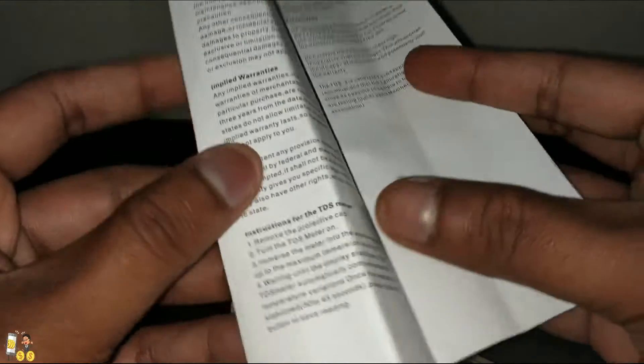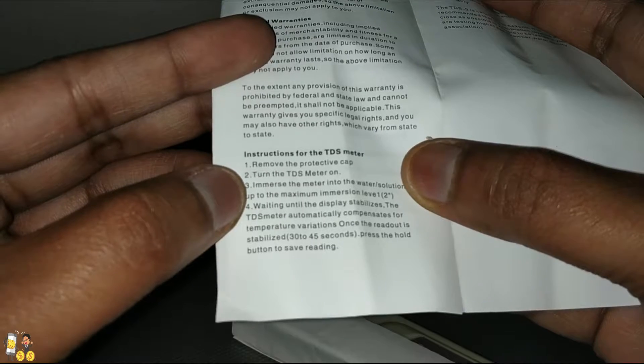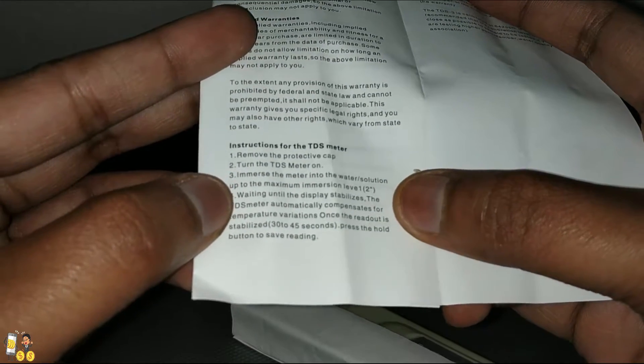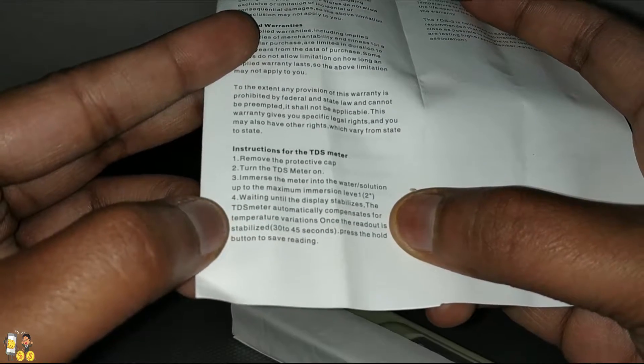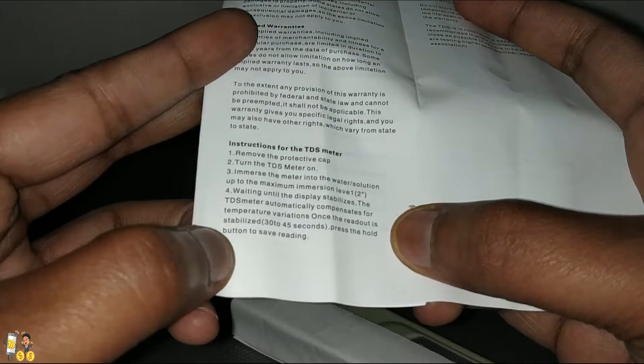Here are the instructions if you are using it for the first time: just remove the protective cap, turn the TDS meter on, immerse it in water up to a maximum immersion level of about 2 inches, then wait for 30 to 45 seconds and press hold to save the reading.